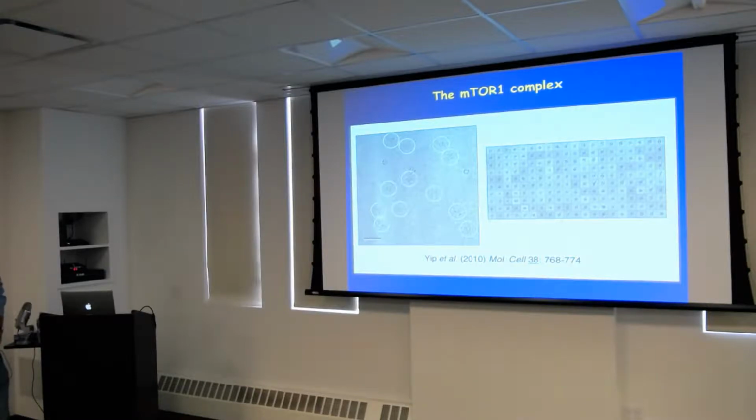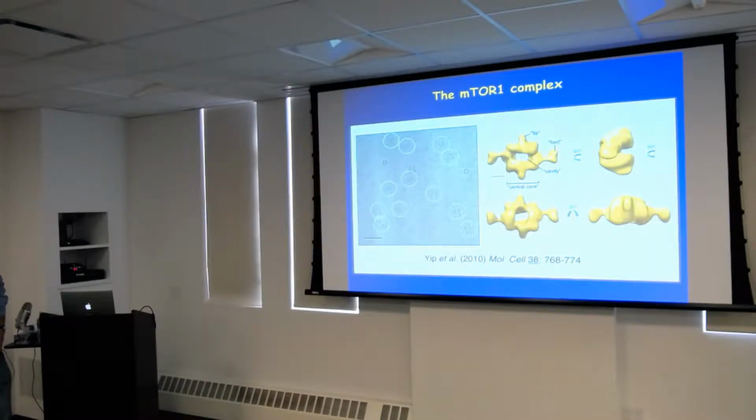And so what you end up with is a density map where you have a very nice resolution in plane, but perpendicular you have virtually no resolution at all. It's all basically the same density. So that's the problem if you miss views. This is an extreme case, but if you have a less extreme case, you might still have very nice resolution in certain orientations, but bad resolution in other orientations.